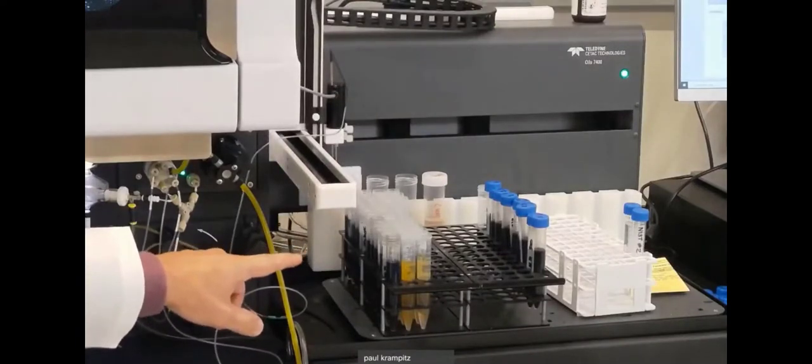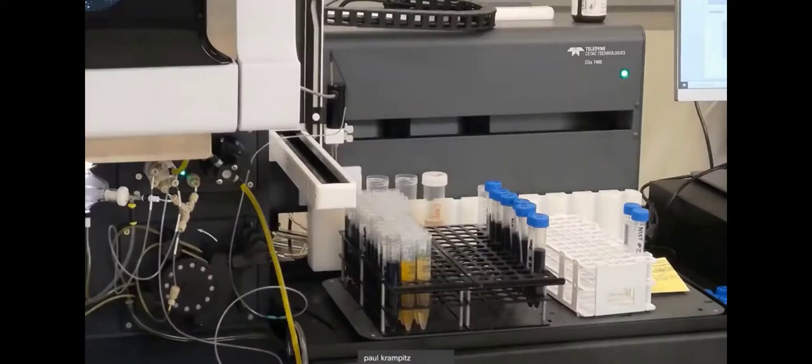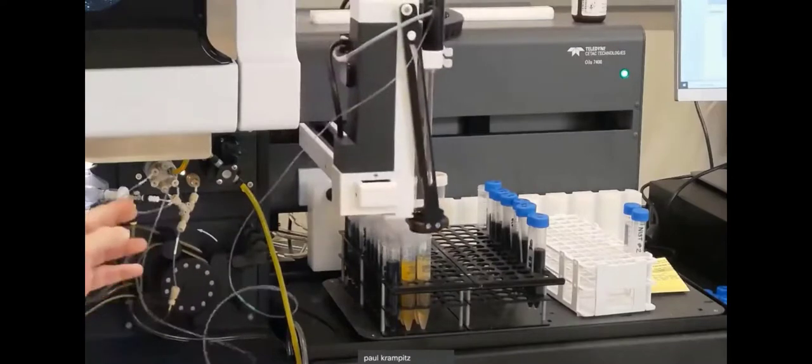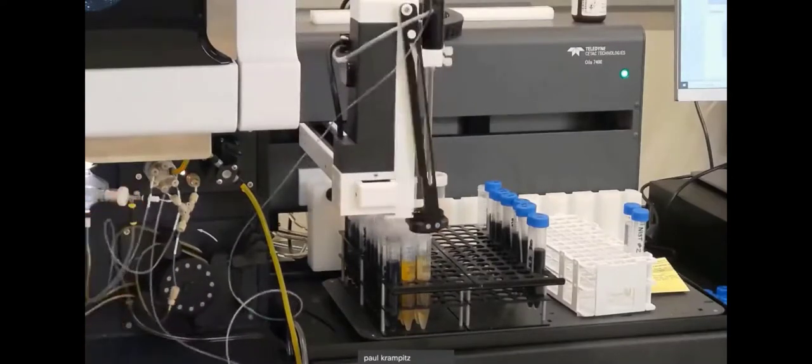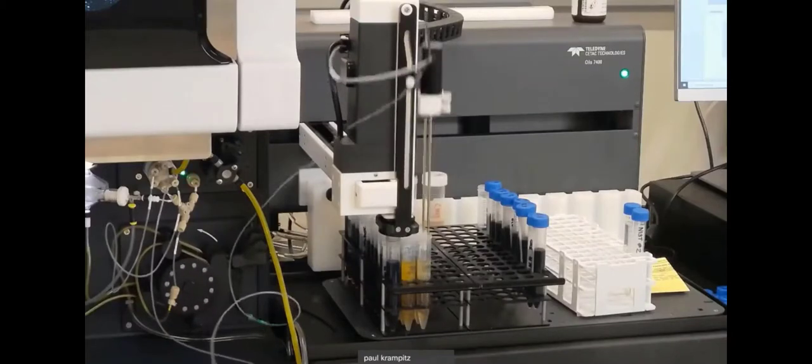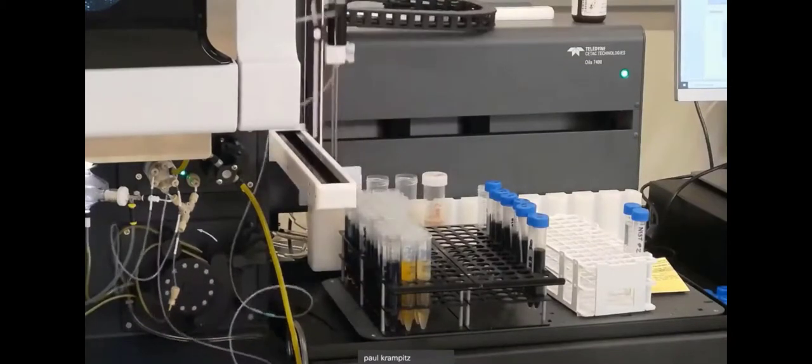table screening that I'm doing right now is taking 17 seconds a sample with a valve. And that's with a bigger loop even. I could probably shave a few seconds off of that. So that may get some of your interest going because it's an immense productivity tool as well. So let me go back one more time here.